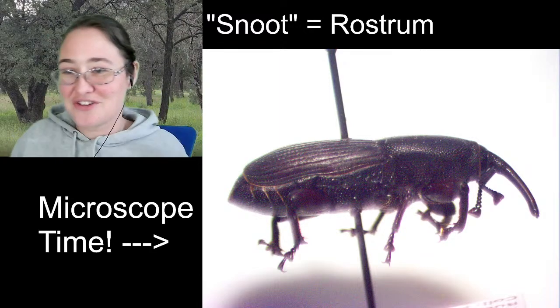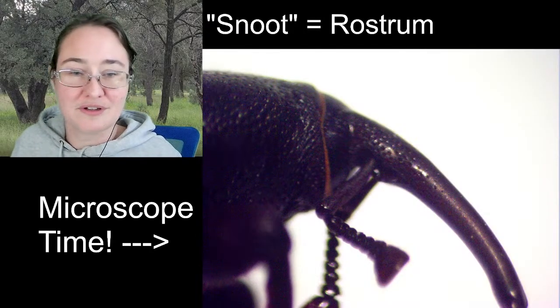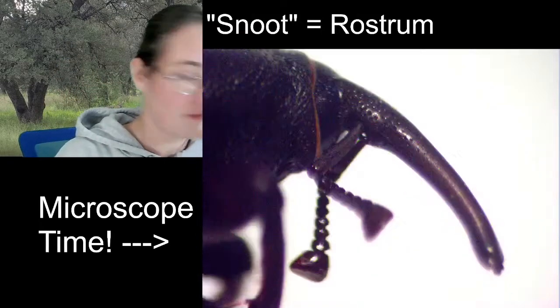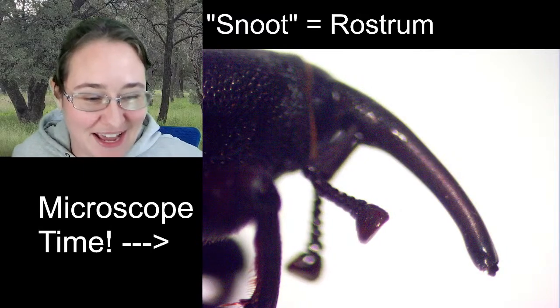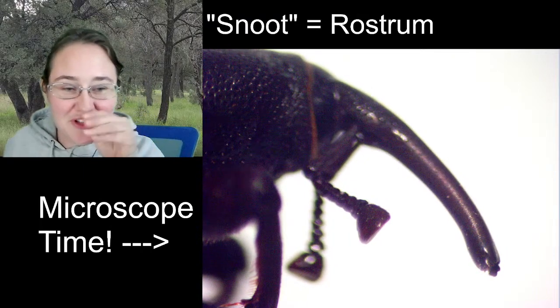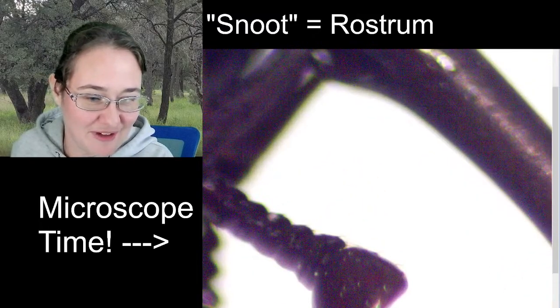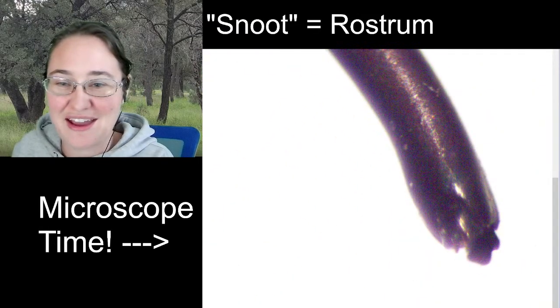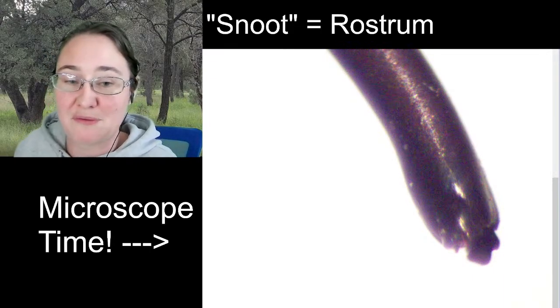I love that you can see, oh, it didn't move. There it goes. I love that you can see the little mandibles on the end of the snoot. So if you look right at the tip, let's see if I can point it out. Right about there, you can actually see both of the mandibles.